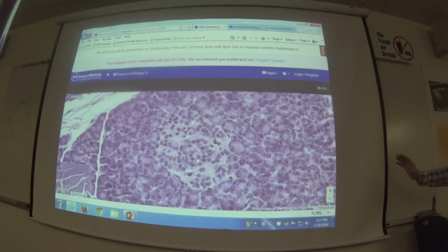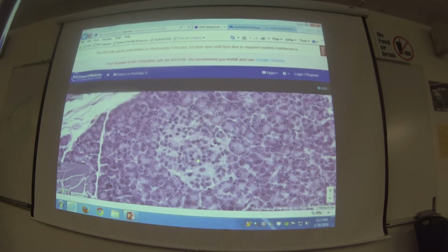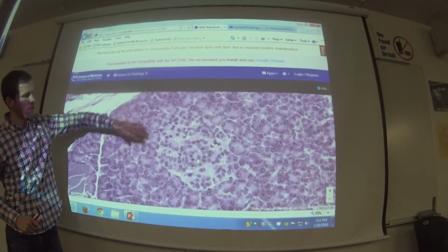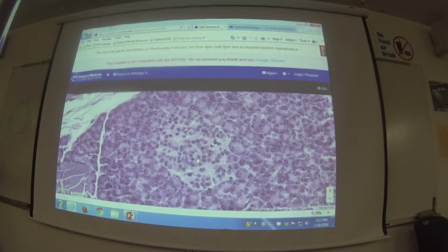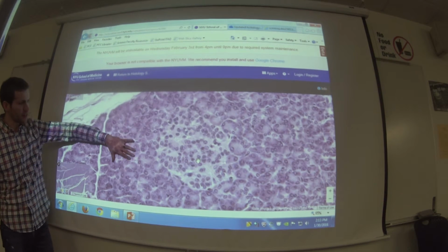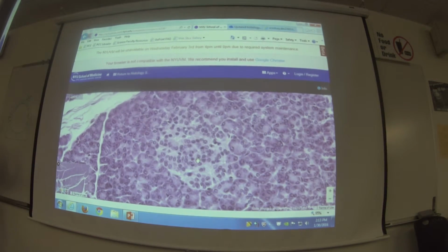So now the contrast, especially if you're close, is a little harder to see, but now you can begin to see how the cells themselves are a little smaller. These are the pancreatic acini. And this is our islet, where our alpha and beta cells are. So the pancreas has two big functions. It's an endocrine organ, secreting insulin and glucagon, and a number of other hormones into the blood. That's why it's endocrine. But these pancreatic acini are the exocrine cells. These are the cells that secrete enzymes mostly, but some hormones, into our digestive tract. And so that's why the pancreas has two main, very different roles.